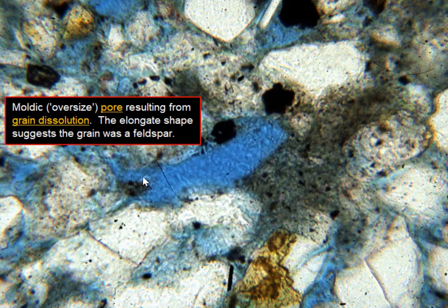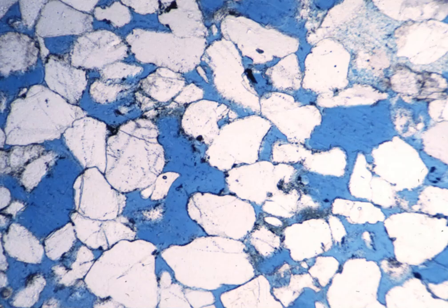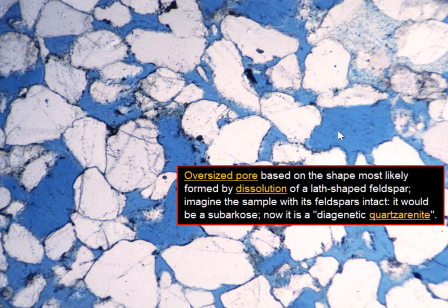See how it mimics a plagioclase lath. And here's another sandstone. Lots of quartz throughout here. This pore is larger than we might otherwise expect.